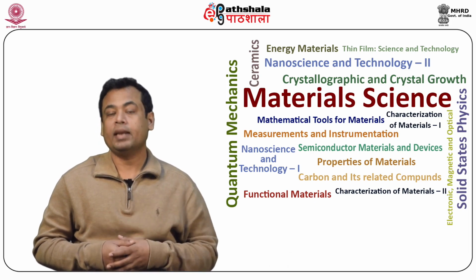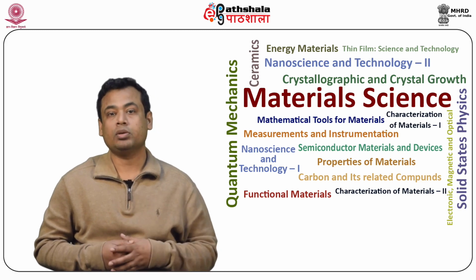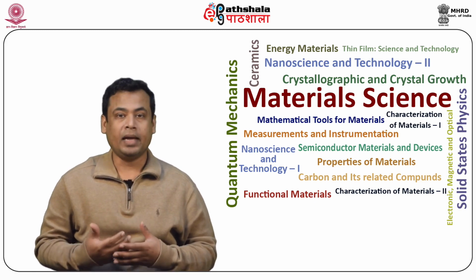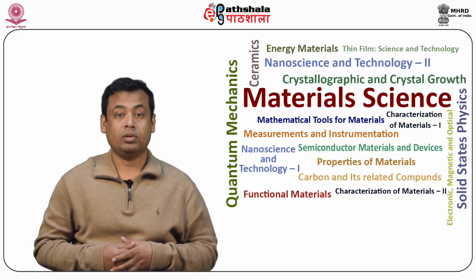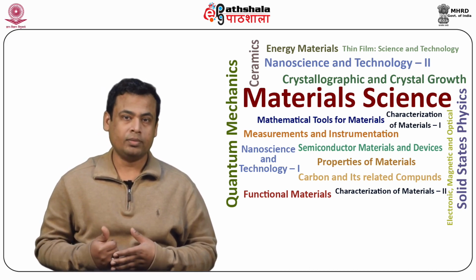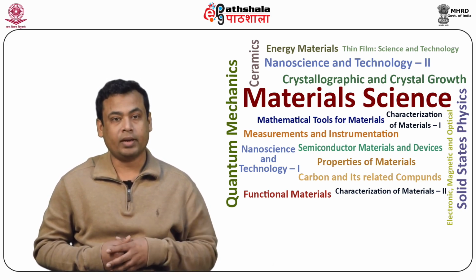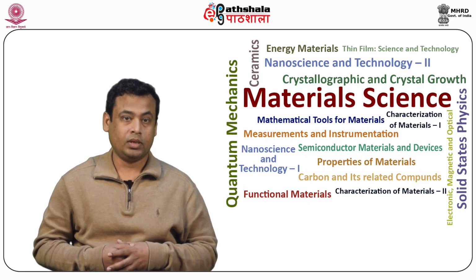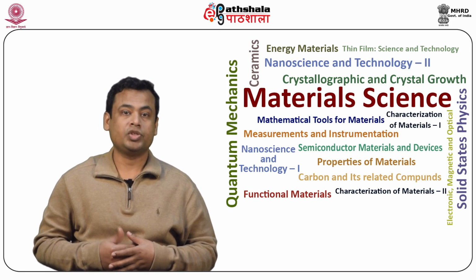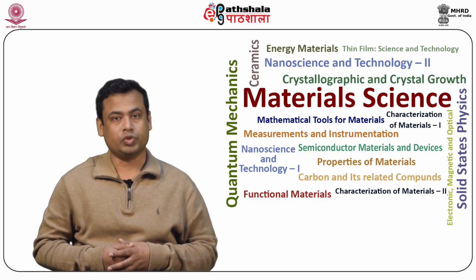The fluorescence lifetime can also be measured with high resolution fluorometers designed in both the time and frequency domains. Accurate lifetime measurement requires photodetectors and signal processing electronics with sub-nanosecond precision. In the time domain, femtosecond or picosecond pulsed lasers are often used as excitation light sources.